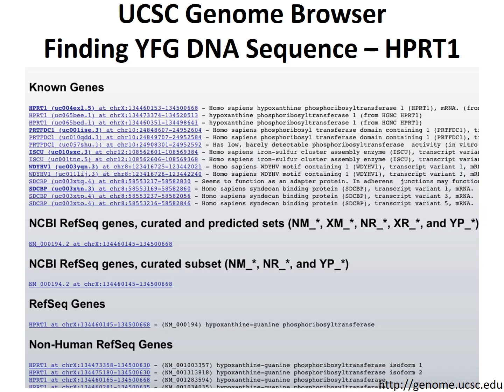This will then bring you to a page where you'll have your known genes, the gene of interest that you're looking at, plus any isoforms or any other related genes to that gene. But what I want you to focus on here is really at the bottom of the page, the RefSeq.